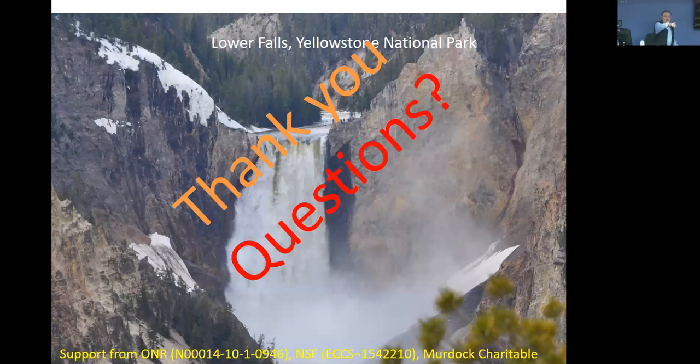First, let me have your question. So what's your typical yield of Auger and characteristics? I had that and I took it out. I thought it was too much technicality. Oh, he asked about the quantum yield of AES electrons and the X-ray emission. Very good question. I actually had an answer there, but I didn't want to be too technical.